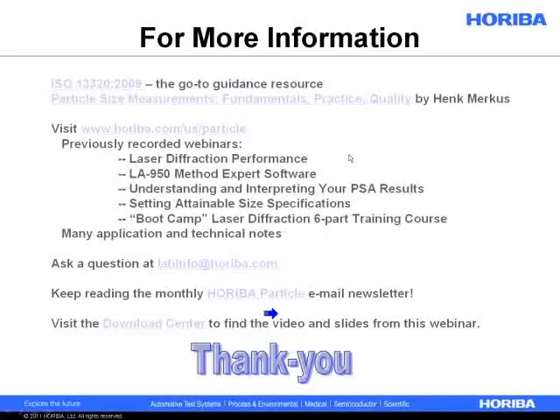Additionally, Hong Sun asks, if one part will absorb the light, how will it affect the total particle size distribution? That's another good question and somewhat difficult to answer too, because it depends on how much of the light is being absorbed. If I was measuring a mixture of titanium dioxide and carbon black, and the physical size of the particles were separated far enough that resolution wasn't a concern, then I would also care about the size a little bit.